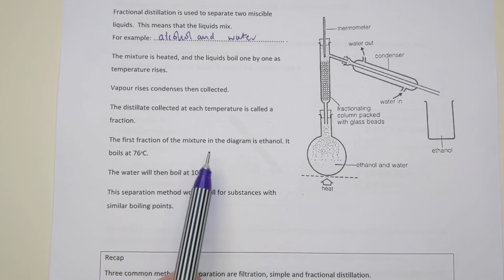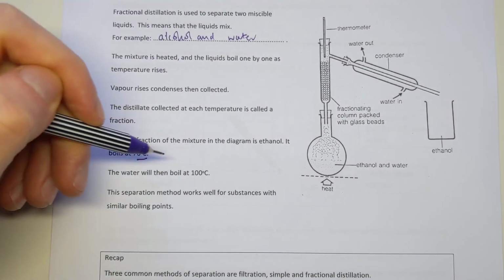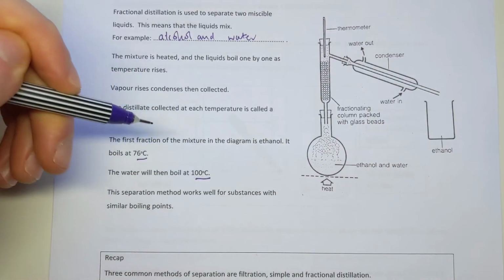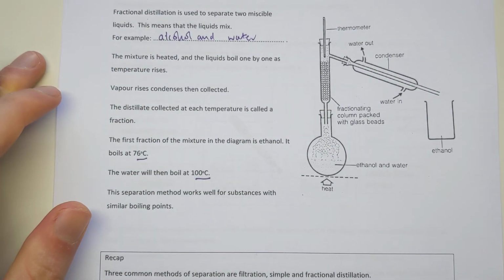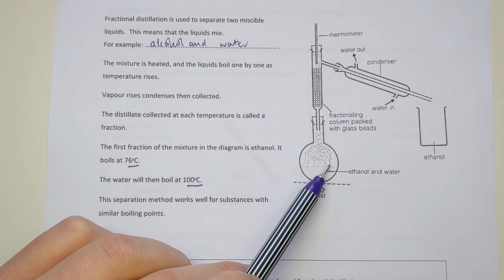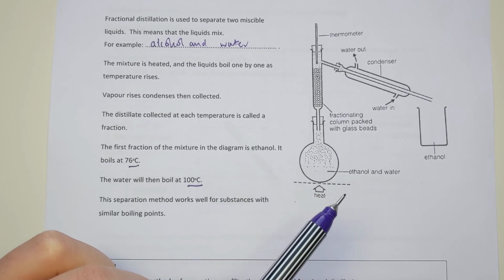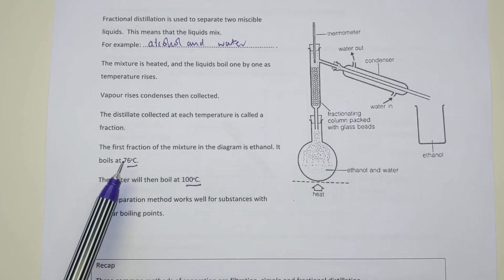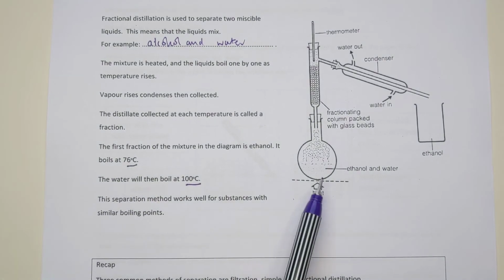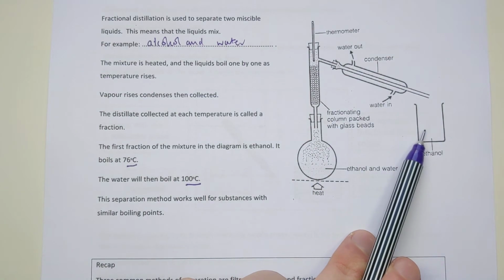So it tells me here ethanol, which is alcohol, will boil at 76 degrees C, but water boils at 100 degrees C. If they boil at different temperatures, I should be able to get them separated by heating them and boiling them. So if I put them in this container together, ethanol and water, and heat them, what should happen in theory is the ethanol should boil off first because it's got a lower boiling point. If it boils off first, it can go through the apparatus, go into the condenser and out the other end.